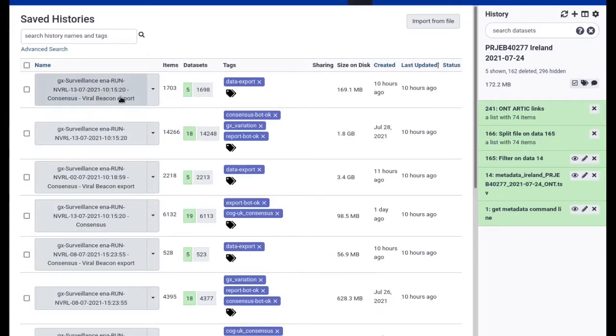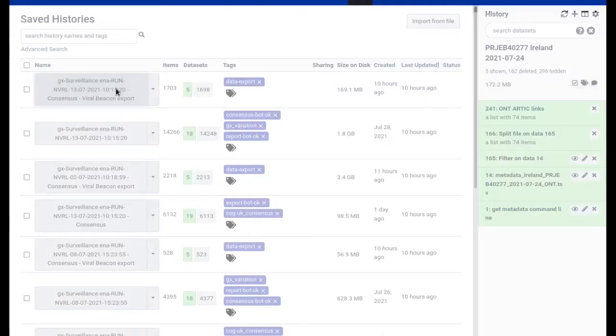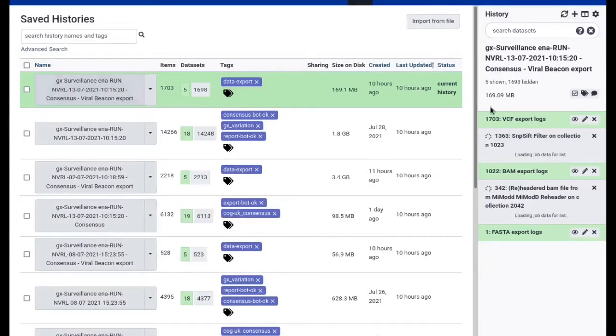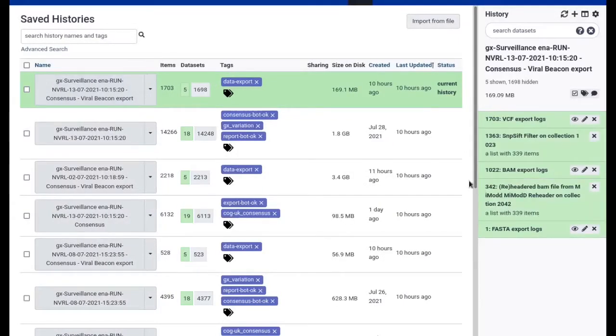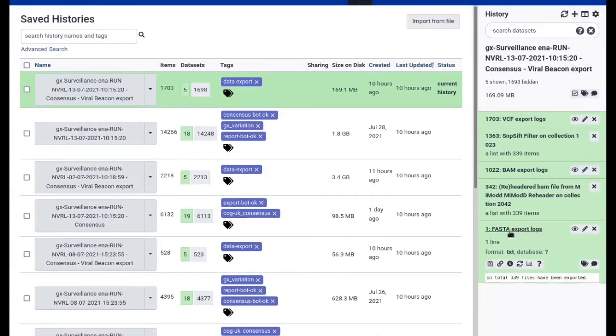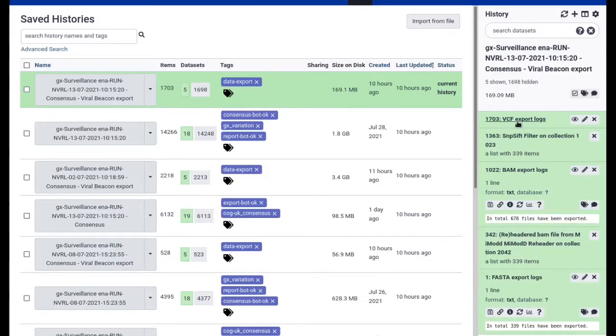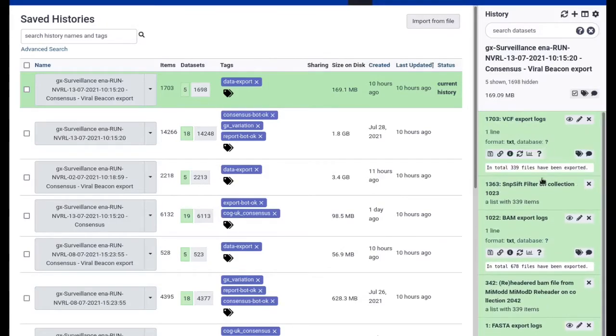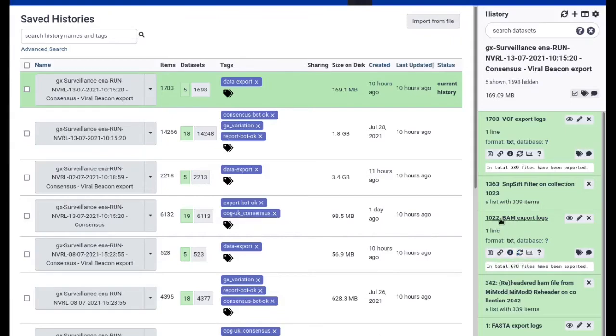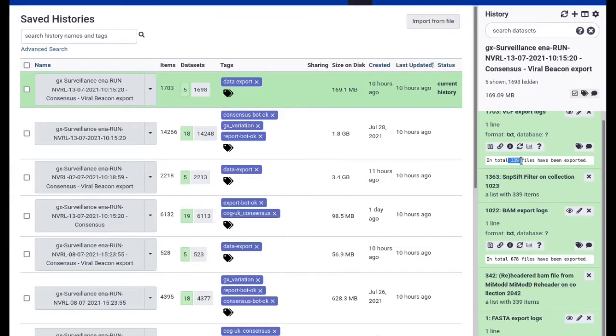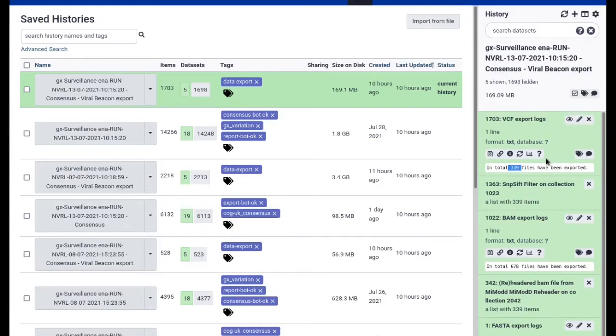I'm going to show you these data export histories now. Here you see one of these data export histories created by the viral beacon export workflow. When we go inside there then you can see that this has actually three export logs in it. So it exported the FASTA consensus sequences, it exported the BAM files, and it exported the VCFs.